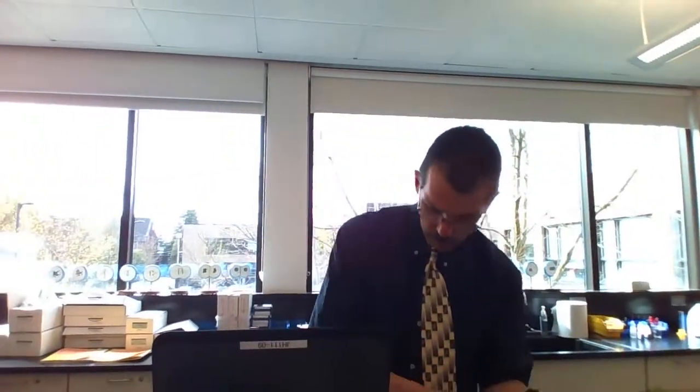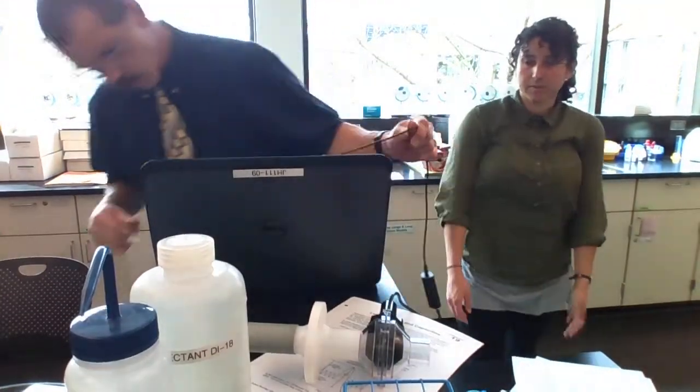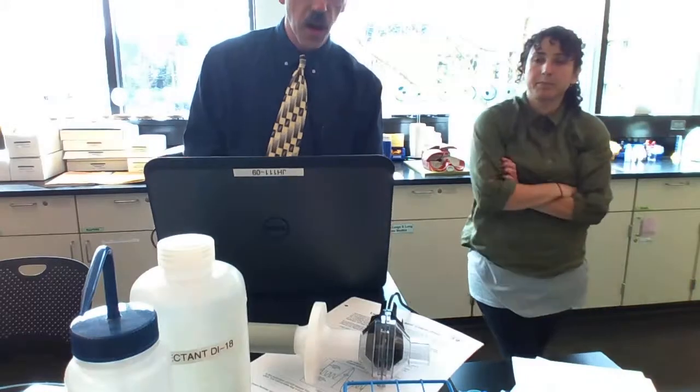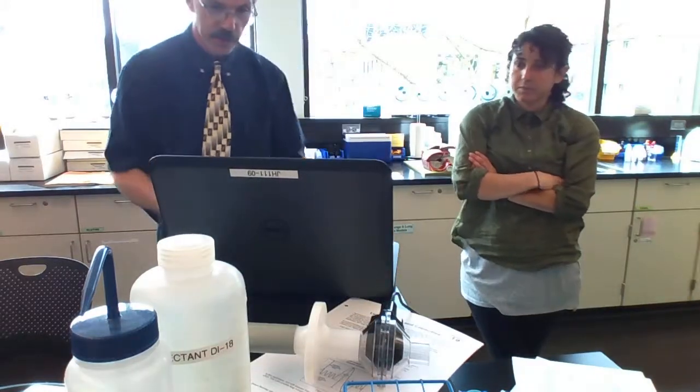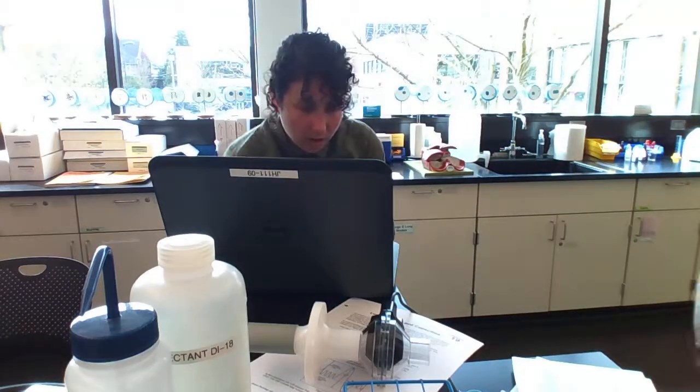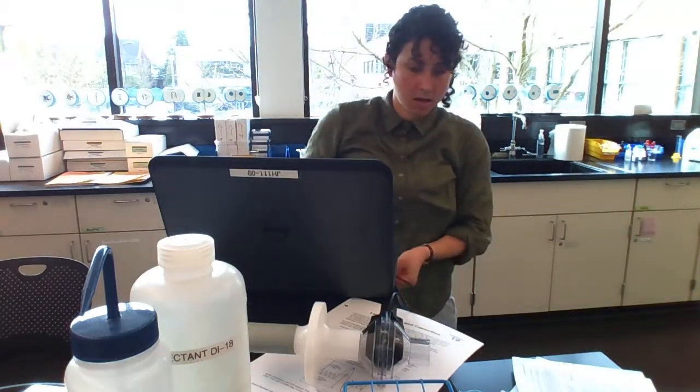We're switching machines because our machine wasn't working. Okay, when this one turns off, turn it back on and see if it wakes up. For some reason, it's not making a volume. It keeps doing total. Okay.